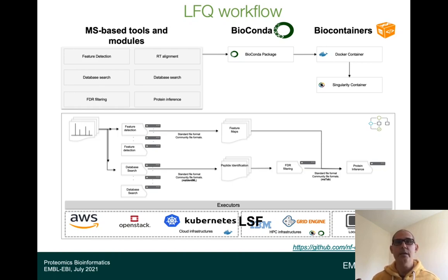For example, imagine you are performing a database search on 20 different files, and one file is failing because it needs more memory or something like that. If you're on a single machine, you would wait 1 week for your server to arrive at that file, perform the search, and then find out that you really need more memory.